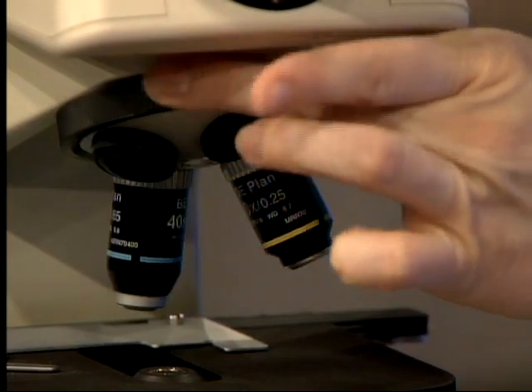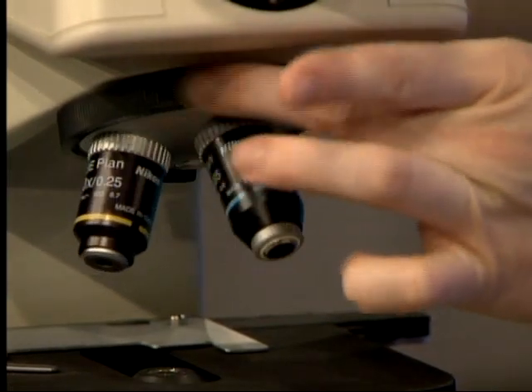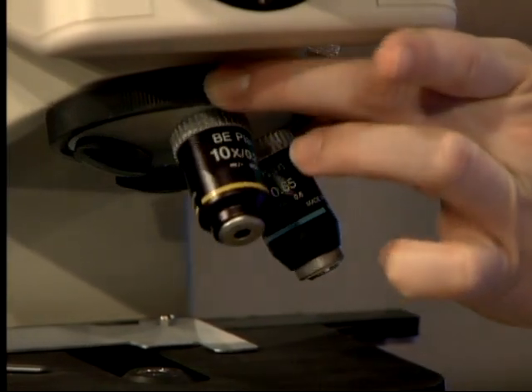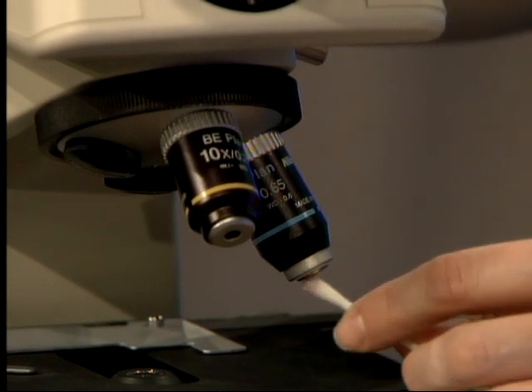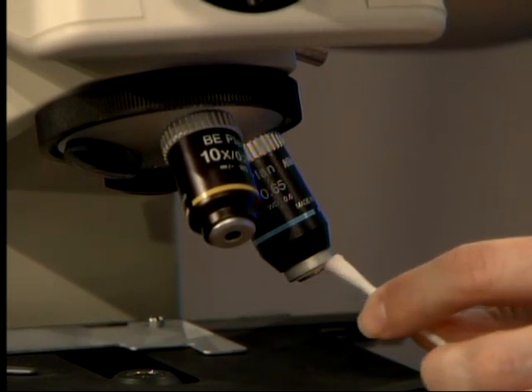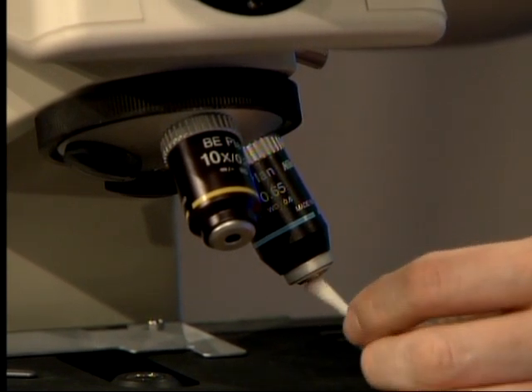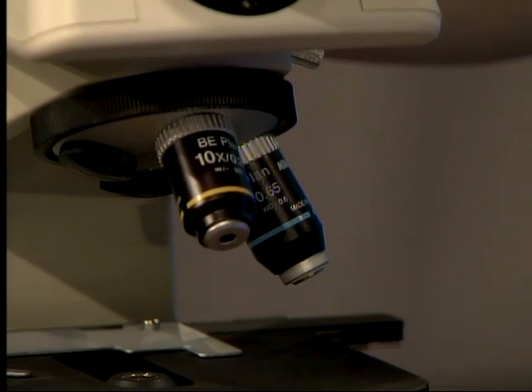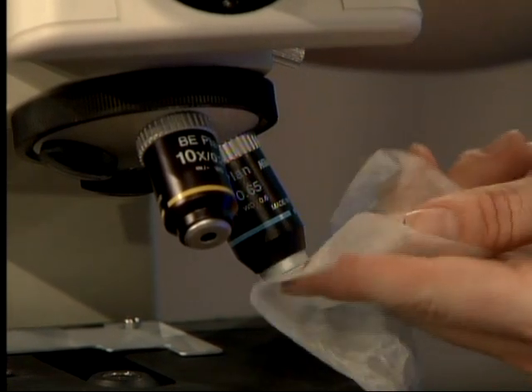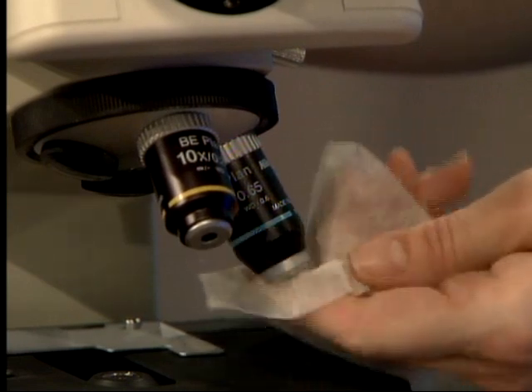Rotate the nosepiece to the other objective and do the same thing — you may need to re-moisten your swab. Make sure you get it well wiped, then take your dry lens paper and buff it off to ensure all the liquid is removed.